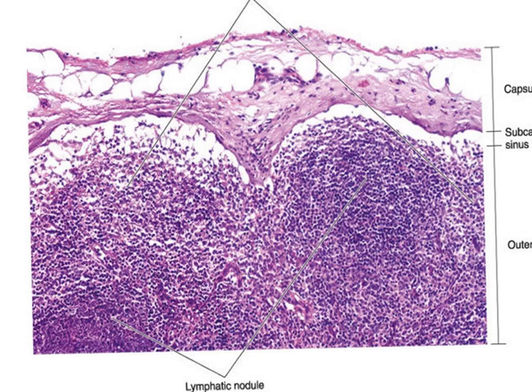This is the picture showing also the outer part of the lymph node. We have here the capsule formed of connective tissue cells and connective tissue fibers, collagen and elastic. Here we have fat cells. This is the subcapsular sinus containing lymph. These are the lymphatic follicles or nodules, and this is the trabeculum here dividing the cortex into regular compartments.